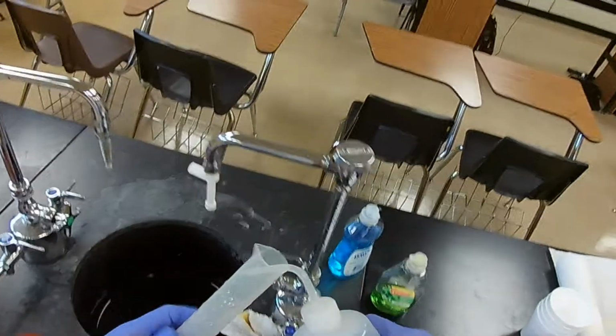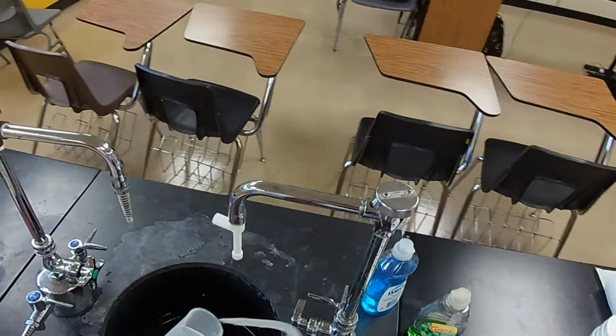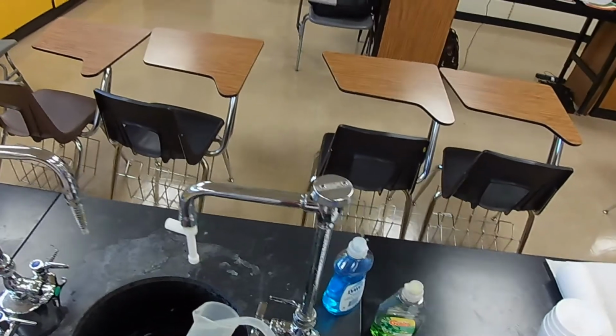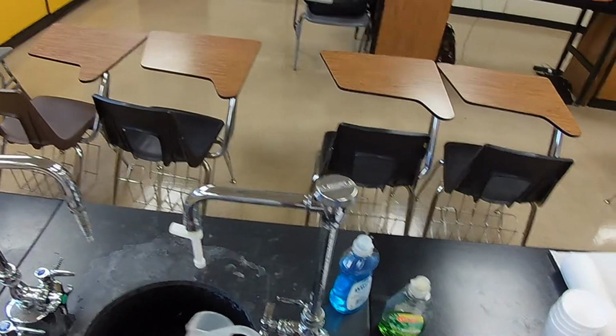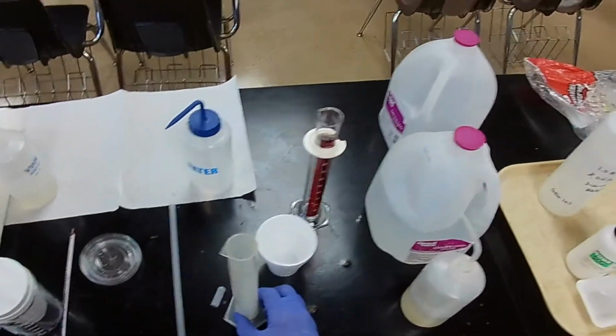Now, notice that the acid is 0.5 molar. It's 1/2 molar. But the base is 1 molar. So we're using similar volumes, but they're different concentrations. Why is that?